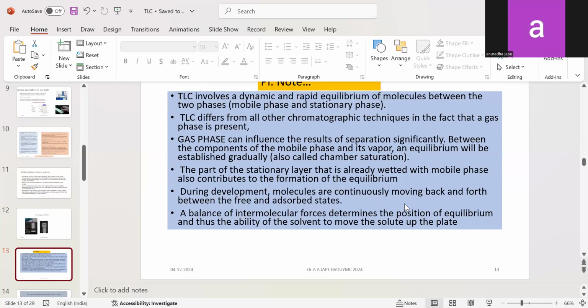It will be working in tune with the stationary phase, as partitioning between stationary and mobile phase is a very crucial step, and preparation of a mobile phase with minimum number of components with good separation is expected.